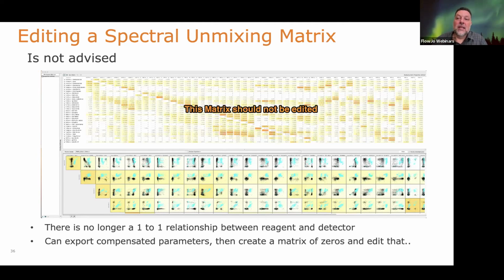I would say if you want to resolve fluorochromes that are very, very similar in spectra, in emission, spectral is the way to go. But if you're doing a 6-color experiment, I'd go with my 16-color Fortessa and just get the data. It's going to be great, right? And I don't have 48 detectors to worry about.